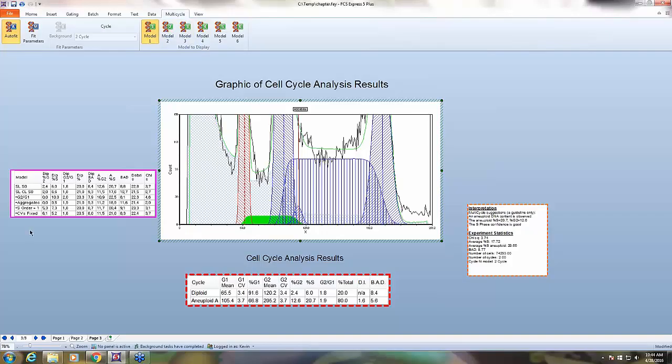It's a little bit of a secret code that you have to learn, but S0 means slice nuclei for the debris, and the S phase is 0. Slice nuclei clumping, the S phase is 0. The G2, G1 phase is fixed. Apply the aggregates model, which is something that we haven't talked about yet. The S order is equal to 1, which means it's sloped, and this one means that the CVs are fixed for all of the histograms. It means that they're all the same.